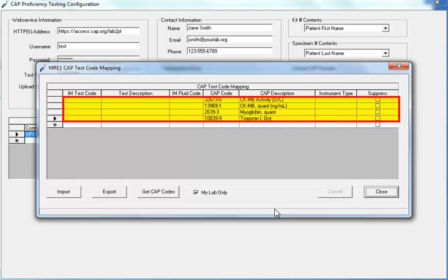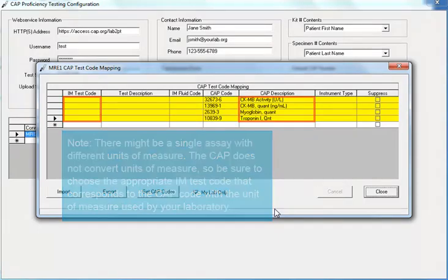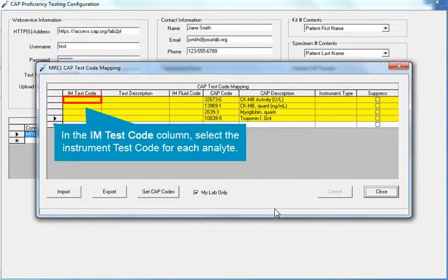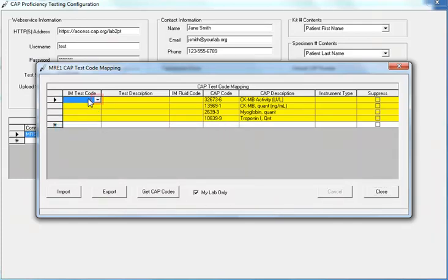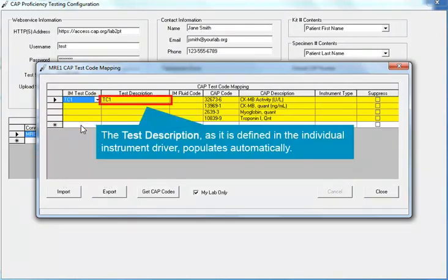Rows highlighted in yellow indicate possible codes that have not yet been mapped. Note that there might be a single assay with different units of measure. The CAP does not convert units of measure, so be sure to choose the appropriate IM test code that corresponds to the CAP code with the unit of measure that your laboratory uses. In the IM test code column, select the instrument test code for each analyte from the drop-down menu. Note that the test description, as it is defined in the individual instrument driver, populates automatically.